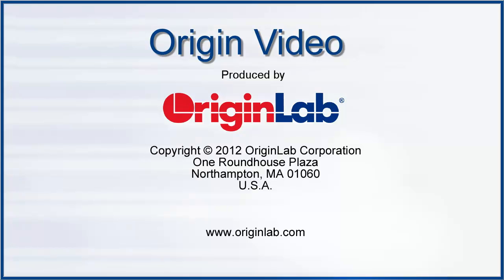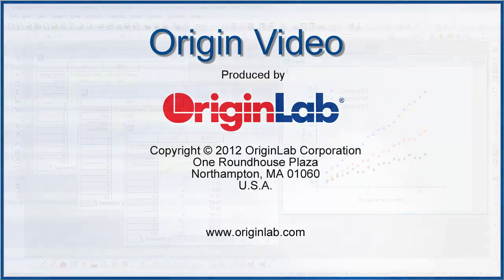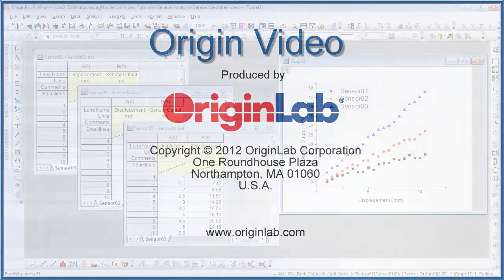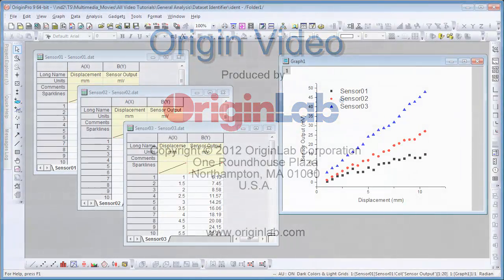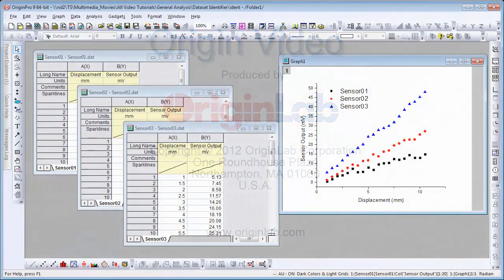In this video, I will show you when analyzing multiple data sets, how to set in Origins Report Sheets an appropriate identifier for your data.